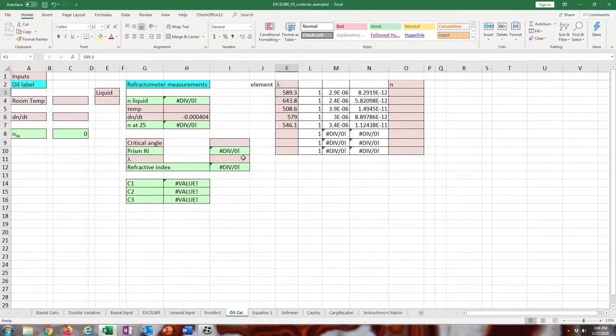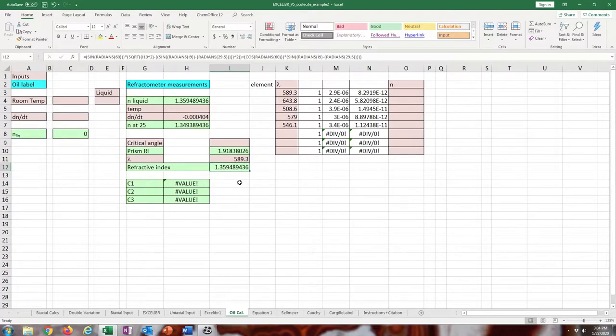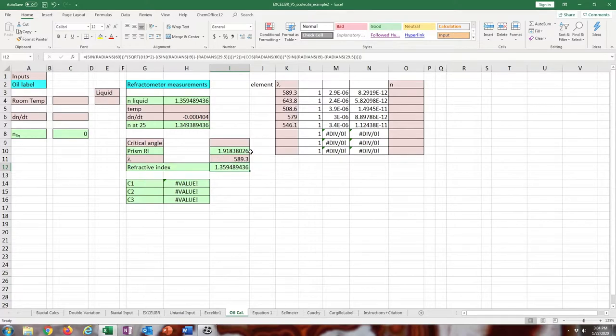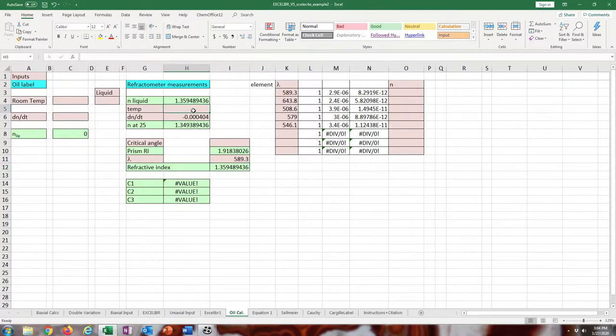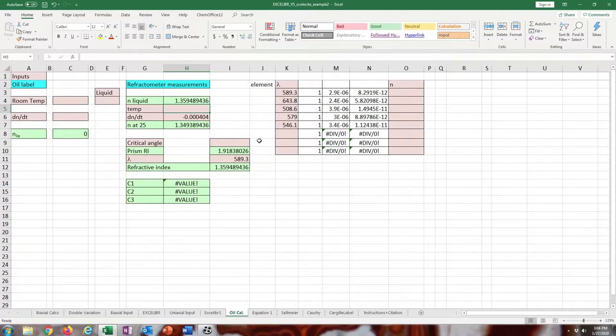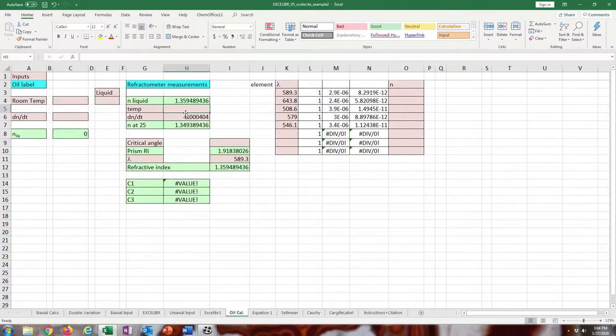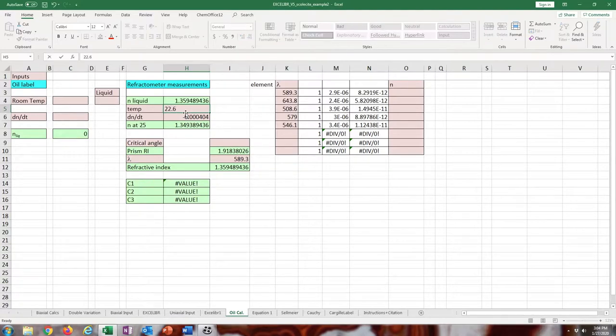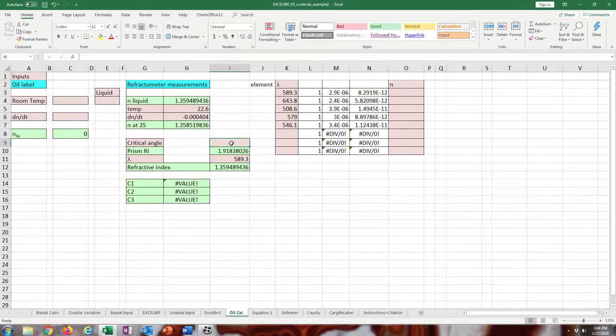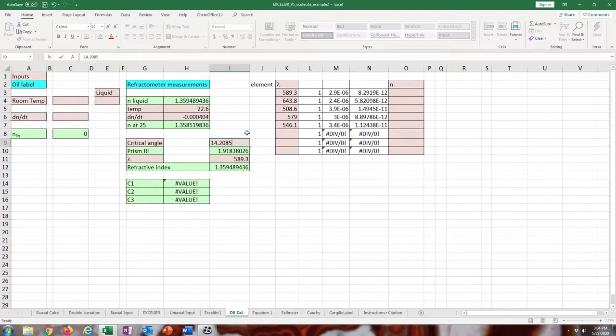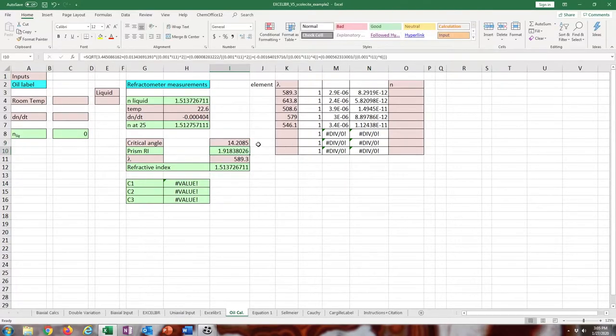I'm just going to enter that in. Once you make that measurement, check what the temperature is and enter that in. Enter the dndt of the liquid which is on the label. That's just the change in refractive index per the temperature. Then this is the calculation for this refractometer because the prism refractive index varies with wavelength and temperature. I'm entering 589.3 for this measurement because that's the gas discharge bulb I'm using for sodium. Enter in the critical angle and the temperature.